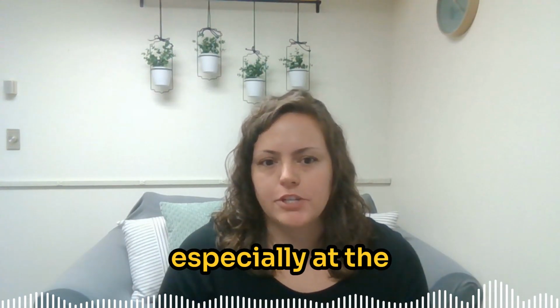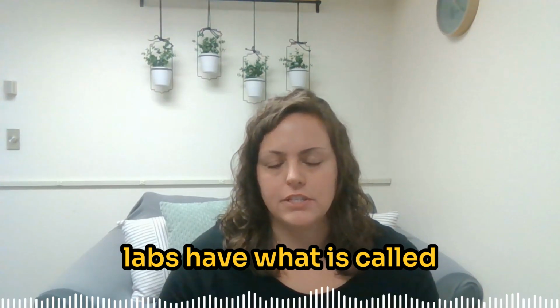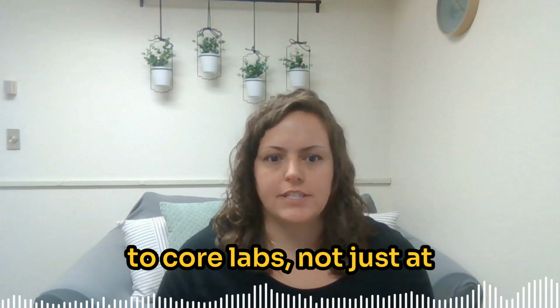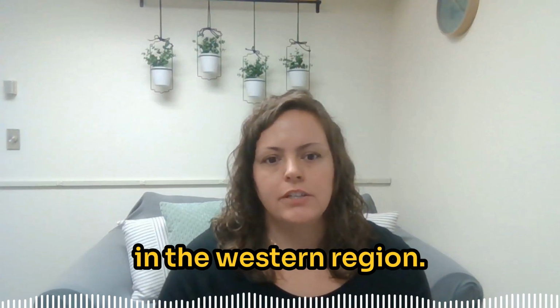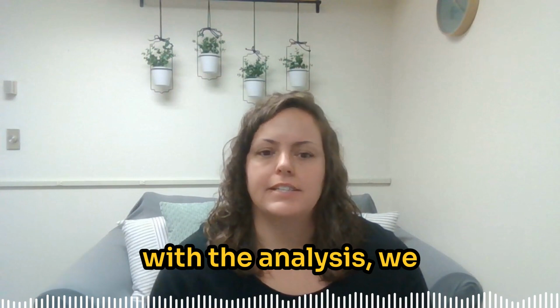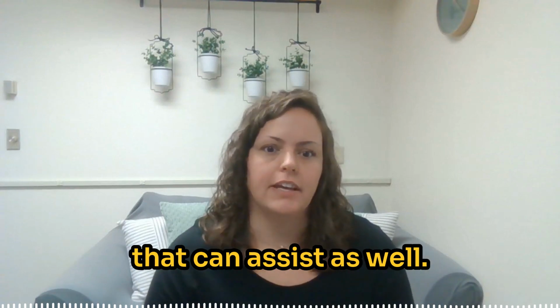Another big advantage, especially at the University of Nevada, Reno, is that our core labs have what is called the IN-BRE network. This is basically access to core labs, not just at the university itself, but to all the universities in the Western region. So if we can't assist with the analysis at our core lab, we can always send it out to another lab, maybe at a different university that can assist as well.